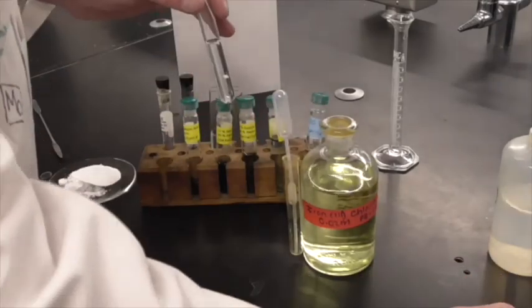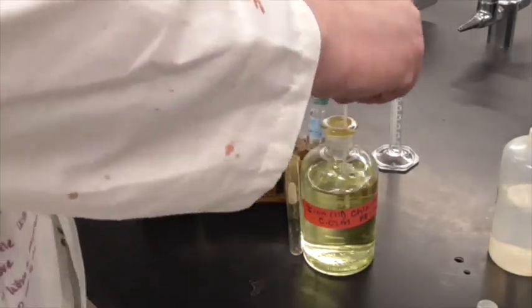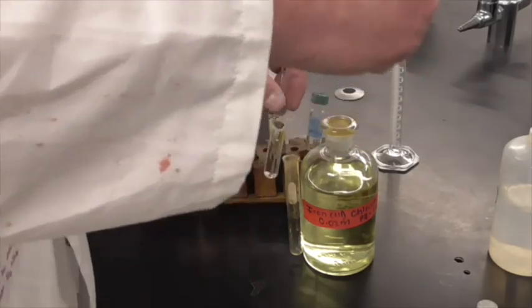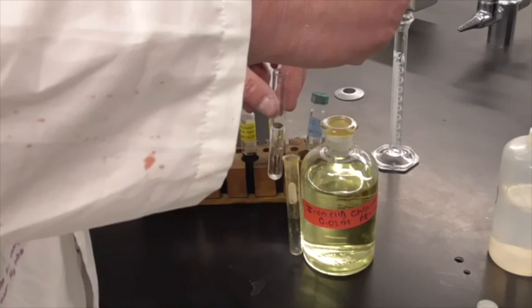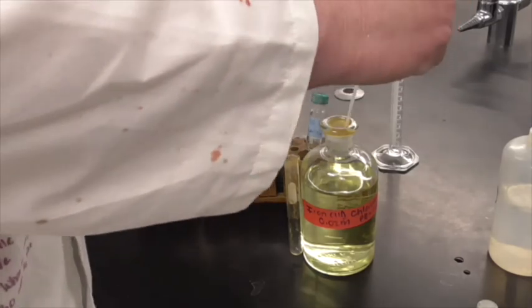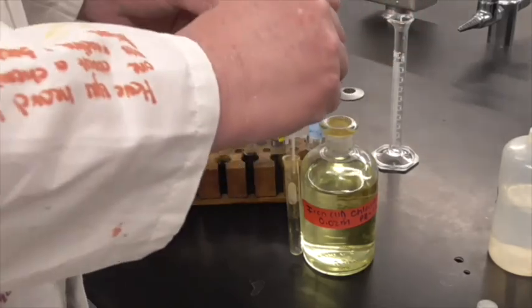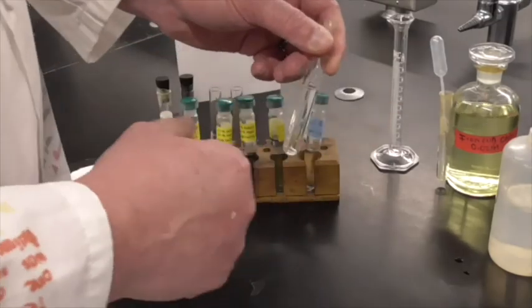Now it tells us to add 10 drops of our iron 3 chloride solution. So I'm going to add 10 drops. 1, 2, 3, 4, 5, 6, 7, 8, 9, 10. Put the cap back on here. Swirl it around a little bit.